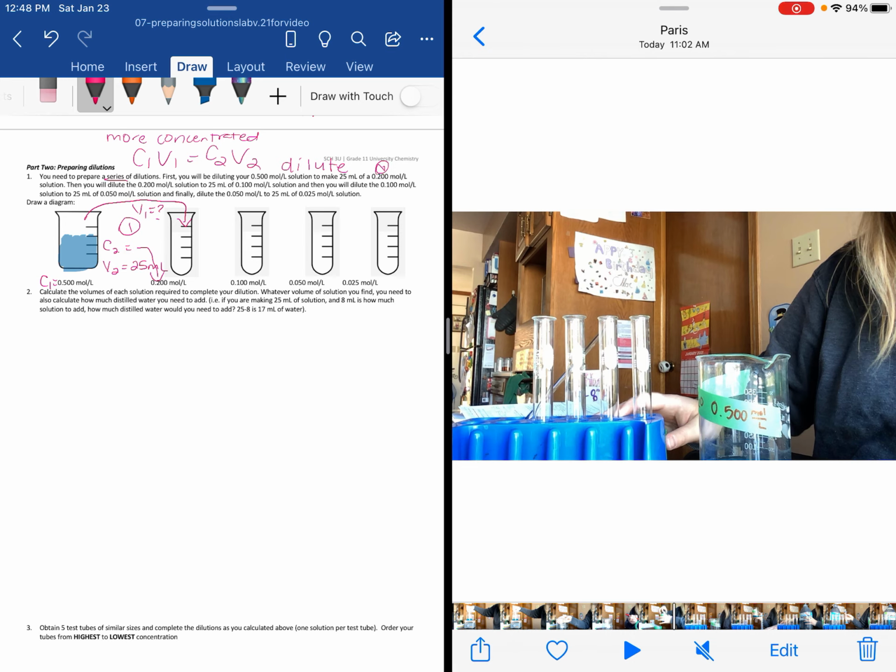Then number two, sorry, I'll fix that, it looks terrible. Do it again.